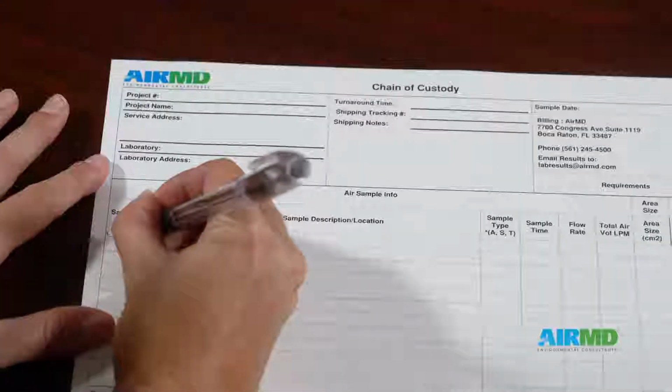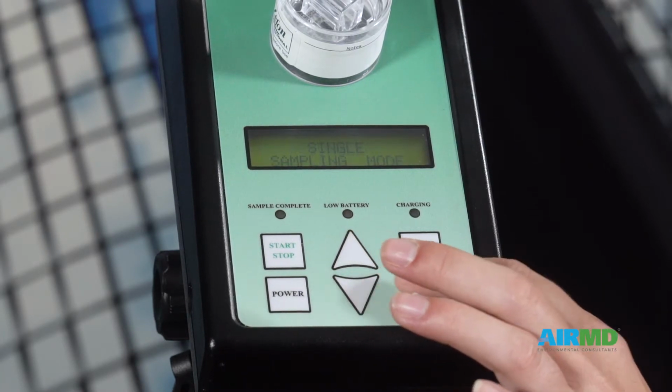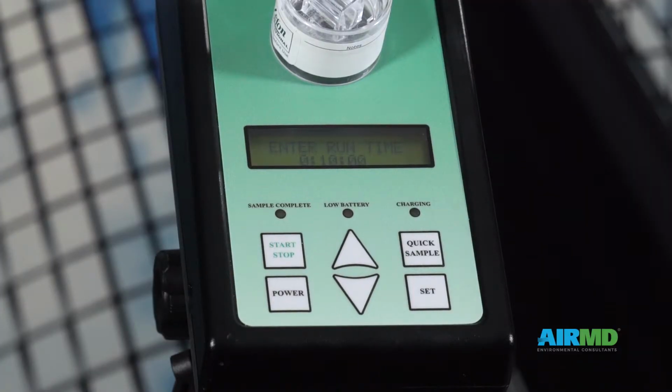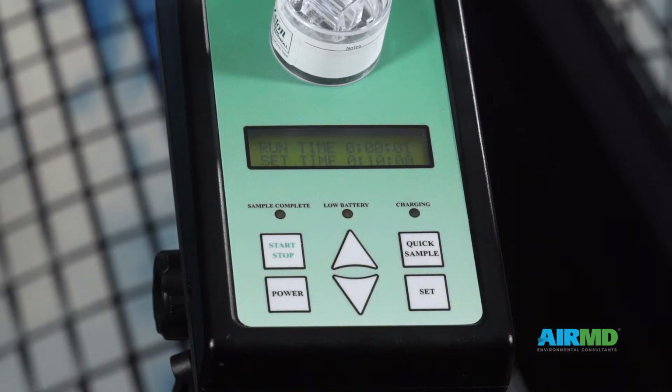Using the pump menu, choose the single sample mode by using the up and down keys. Press the Set tab once the sample runtime option is found. Sampling times for mold air samples should be 5 to 10 minutes depending on the type of assessment. Press Start on the pump and let it run for the sampling time.